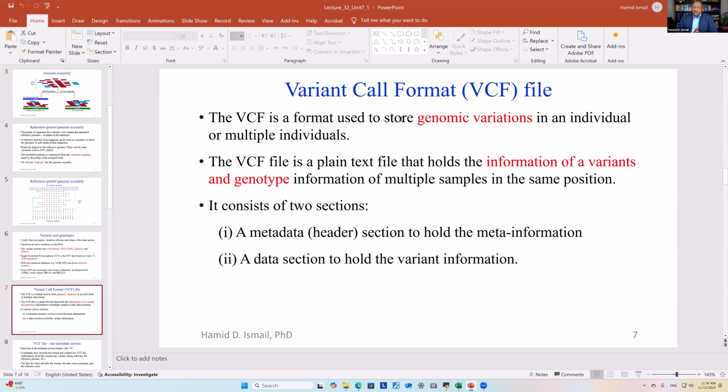Okay. And we will come and discuss variant calling or variant discovery, but before we go there, let's understand the concept, before we go and generate that file. We use this to identify the variant, and by variant we mean mutation.